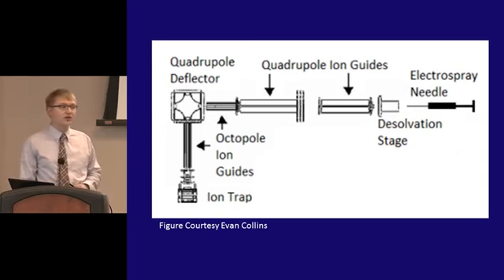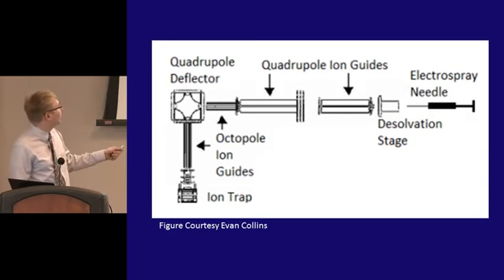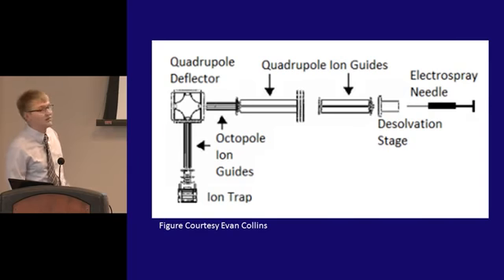However, in order for photoelectron spectroscopy to work, we need to be at ultra-high vacuum. So 1/millionth of 1/billionth of 1 atmosphere. So 10 to the minus 8 torr, or about 11 orders of magnitude different than the room we're standing in now. So these ion guides help us move slowly from room pressure down to high vacuum.